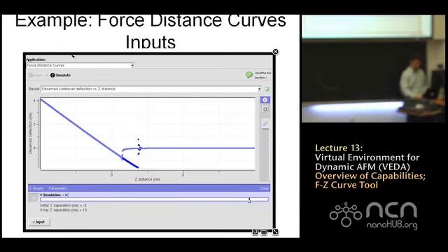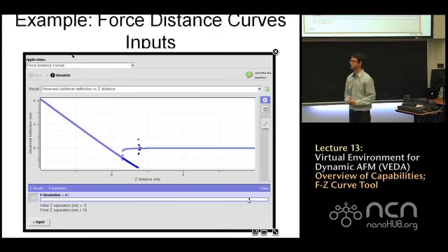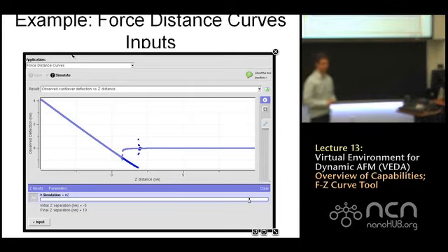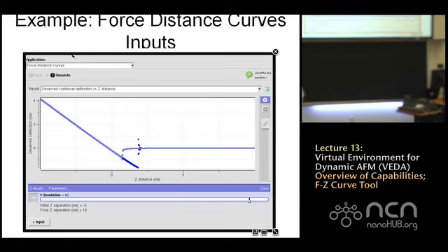And finally, we can actually do the retraction curve. This got put out of order, I think. Sorry. Okay, so if you go back to the previous page, I'm missing the input slide for this. But what you can do on the input for the operating conditions is invert the initial and the final z separation. Maybe I can do this on the web page.